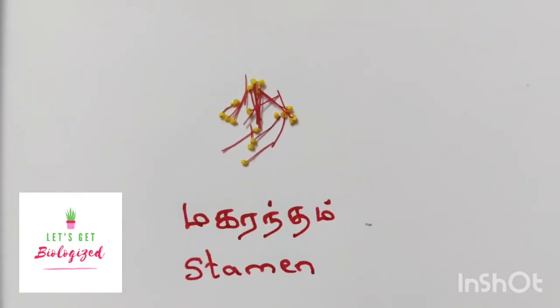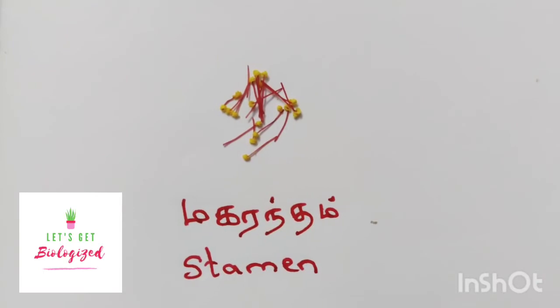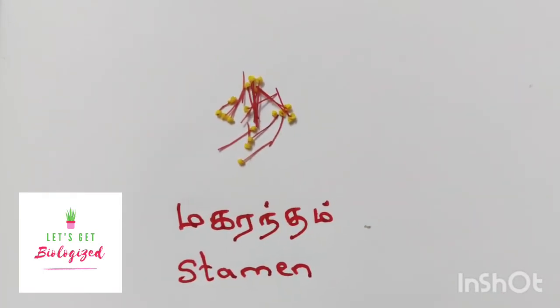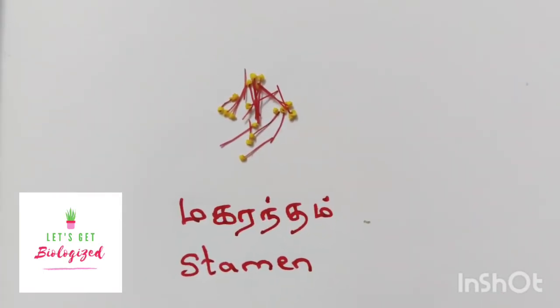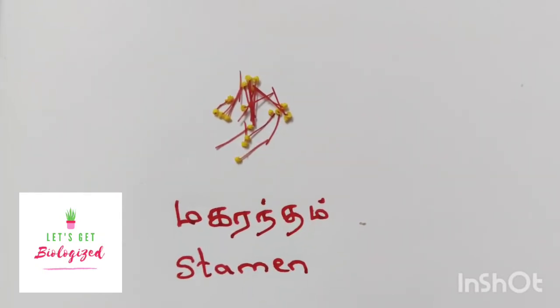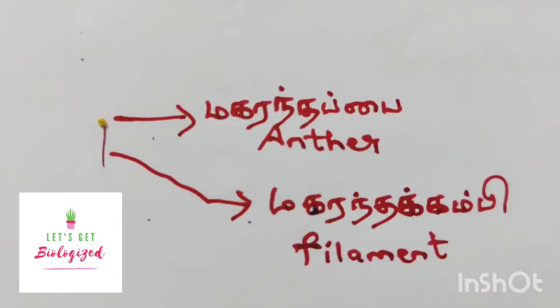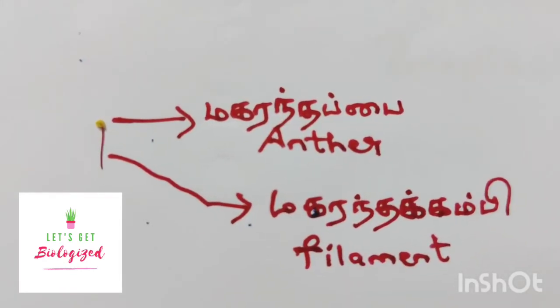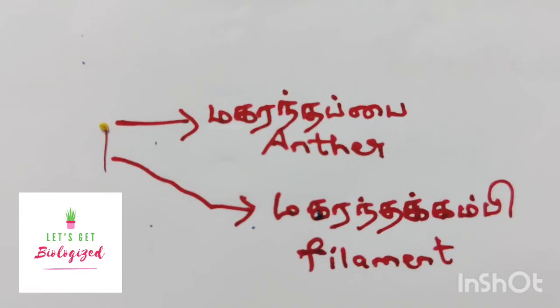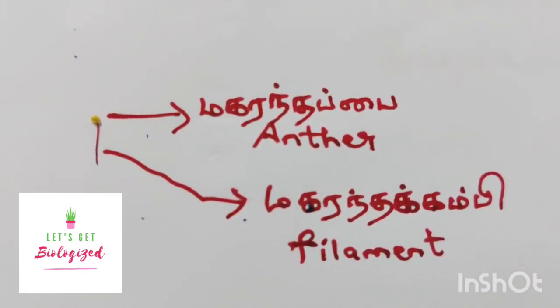And this is the stamen — the androecium, the male part of the flower. This is the part which produces pollen grains. This is a single stamen showing the anther and filament. The anther is attached with the filament.